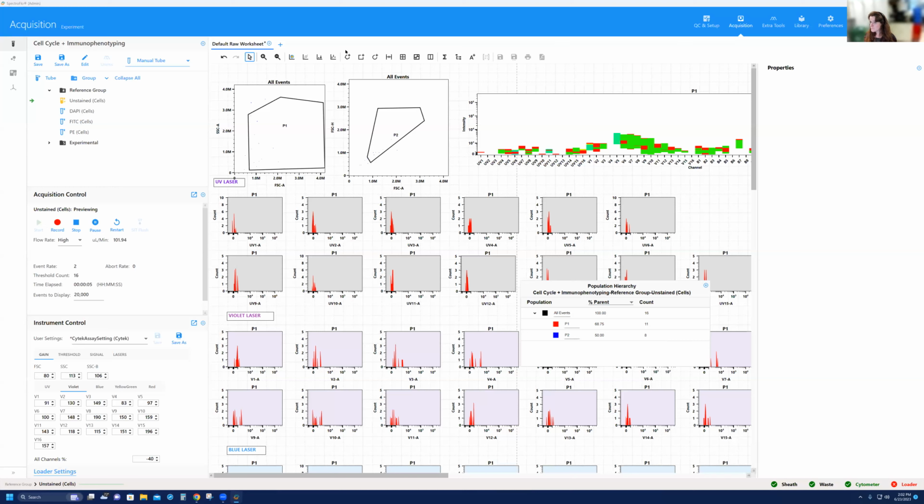While you're running the bleach, there's a question here that's related to adjusting the gains. First, I would just comment on the fact that this is a spectral system, and I know that sometimes this can be a bit confusing for people that are still novice with spectral, but it's important to know that you should use all of the lasers that are available, right?